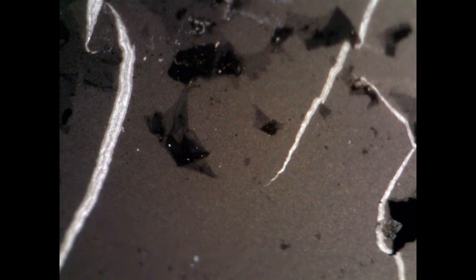These are just fragments that have broken off and deposited on the smooth area. As we move left here, you can see it starts to get dimpled. We go a little bit more and the dimples are getting bigger. There's this sudden demarcation where you start to see the underside of what I call the lily pads. You can see a zigzag in that stretch mark there.